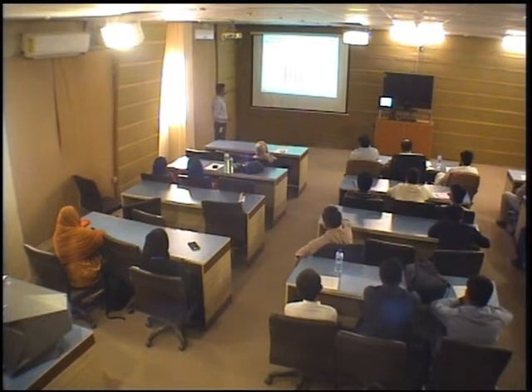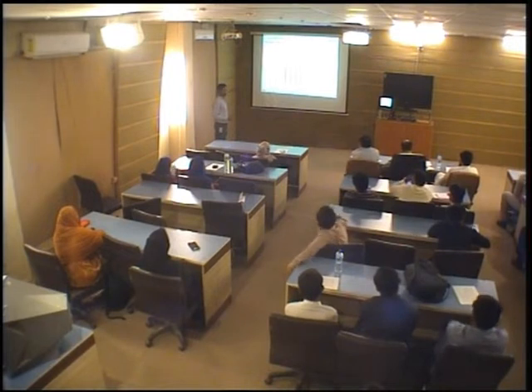Concentration of elements present in a face polisher and eye shadow. We have observed titanium has the maximum concentration using the calibration free LIBS method in a face polisher and eye shadow.